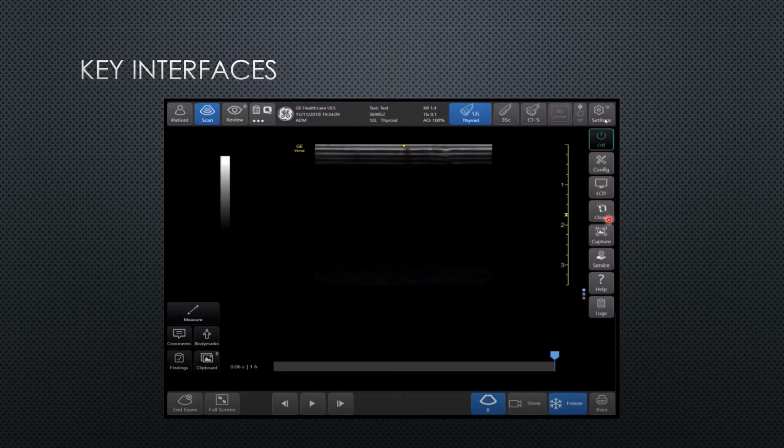Clean will shut the screen mostly off and allow you to just wipe down the screen with the cleaner. What it does is basically ignore all touches except for a specific touch, which is like a swipe across the screen. The old version was touching two places at once, so that way you can safely touch the screen. You don't need any of this stuff either. We don't have a printer on ours, so this is not a big deal either.